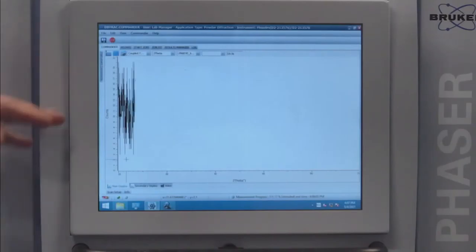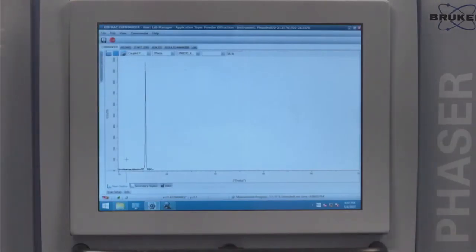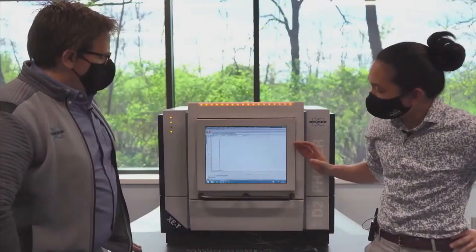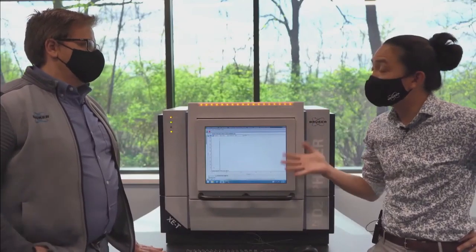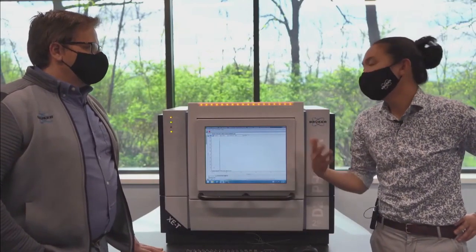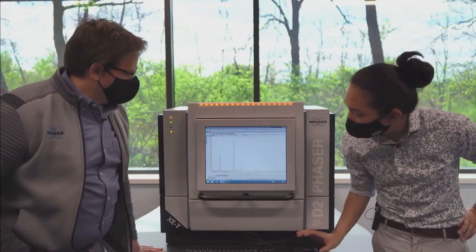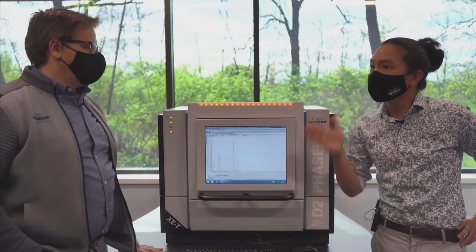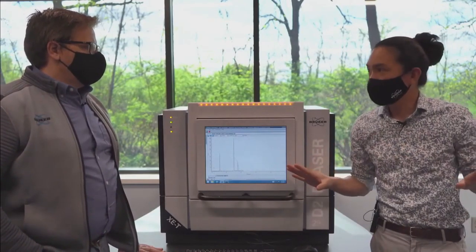So one thing I noticed right away is that the overall signal has dropped. Right. Quite substantially. So what you're going to see is that the K-beta filter, like you just mentioned, is going to dampen all the beam. I mean, you're putting something in the way of the X-ray and the detector, right? Yeah. So what you effectively see is about a factor of two. Okay. You lose about a factor of two. So 50% less intensity across the entire data collection.